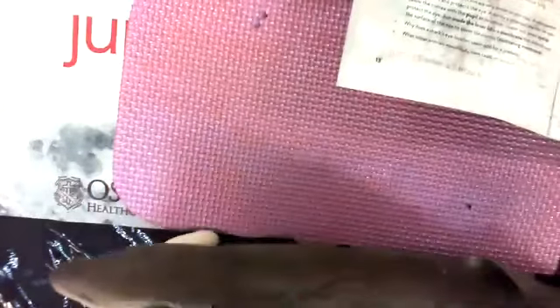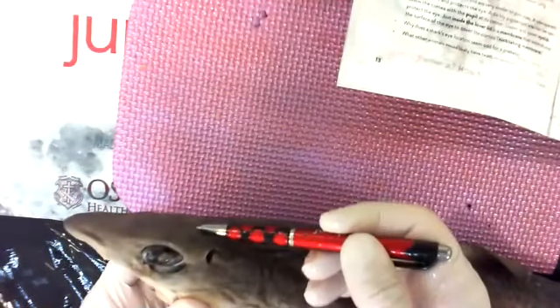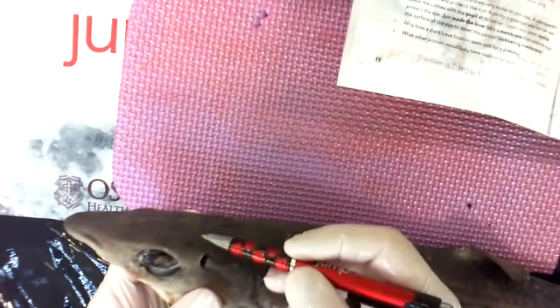So we have an external ear that catches the sound, redirects it down to the middle ear, which amplifies the sound to push it into the inner ear, which is the cochlea, right? Where the cochlea is at. So this external ear catches sound for us. We hear it, we push it in the direction we want. Sharks don't like that. Sharks hear through water pressure changes, right? So the water pressure changes the water in this area. They can feel the vibration through their skull. It shakes the inner ear, the cochlea, and sends the sound signals.